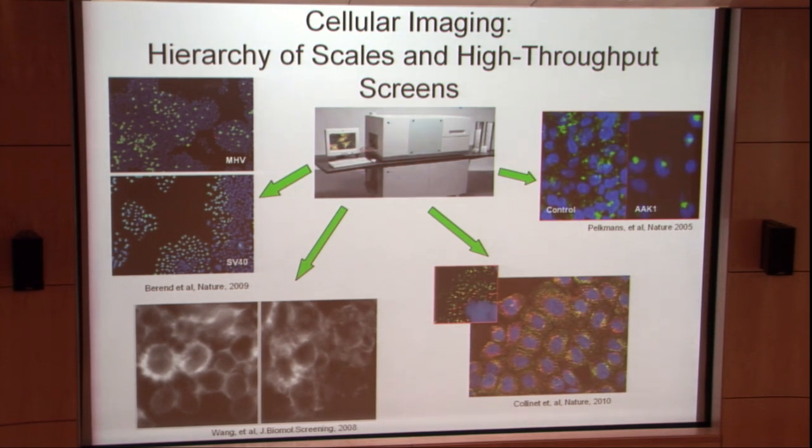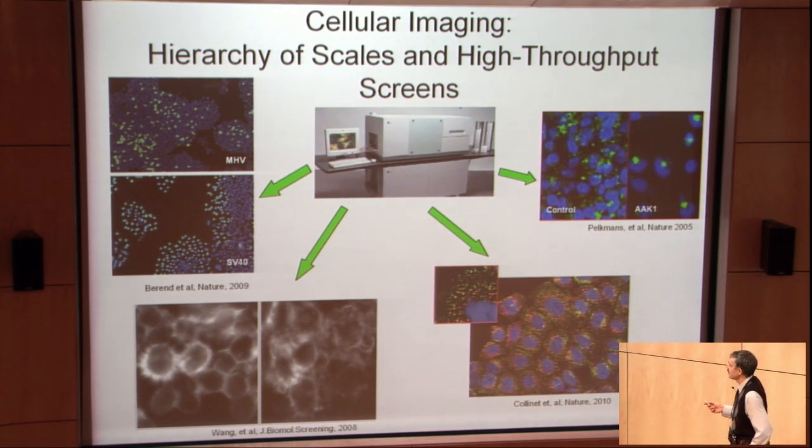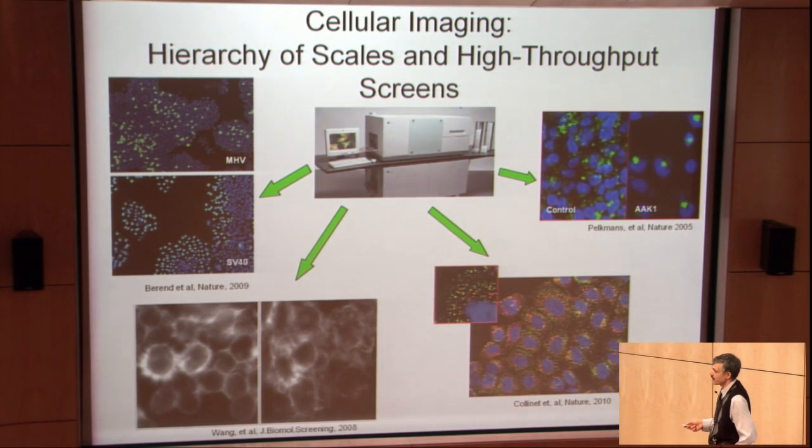So in this case, you see the authors put the virus in the cells, these two different kinds of virus. And they see that here the virus, this is fluorescent virus, is mostly in the middle of the colony. But the opposite virus mostly infects the edge of the colony. So this is a very different presentation than if you go here, where you see much bigger cells, and you see how cells are organized and what the boundary between cells looks like.